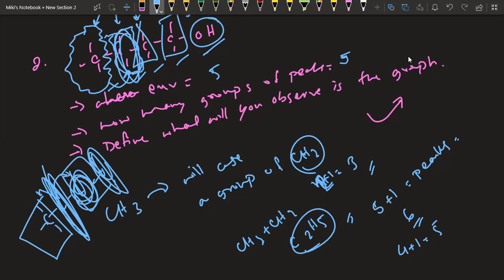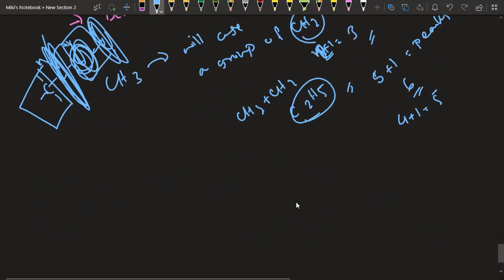Okay. Now, moving to the next portion, we have this OH group. This OH group is bonded with which part? This CH2. That means we should observe a singlet due to that OH group. A singlet will be there due to that OH group, isn't it? And it should be somewhere in the region between 0.5 to 6.